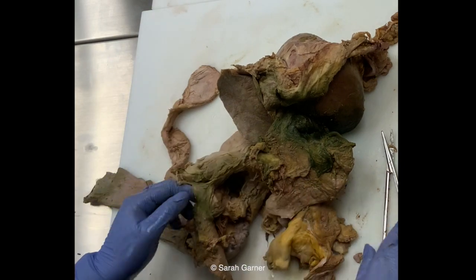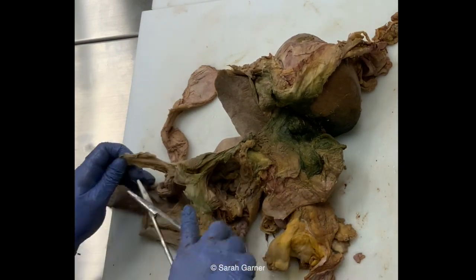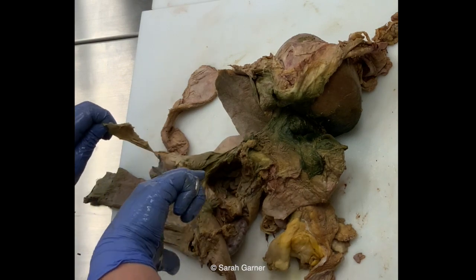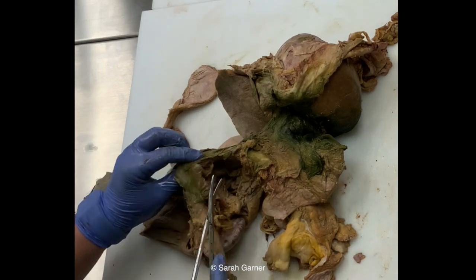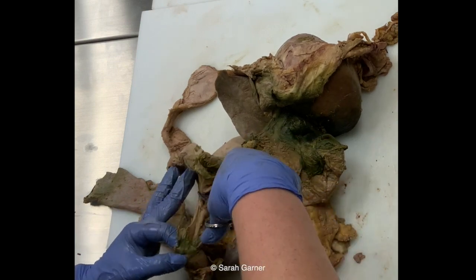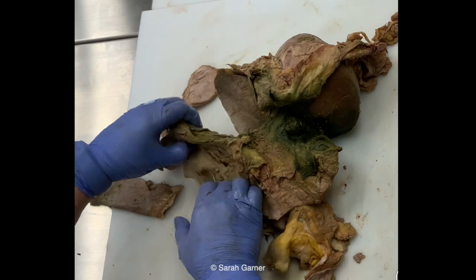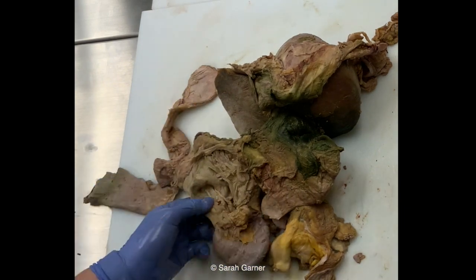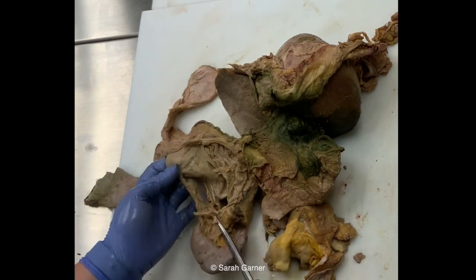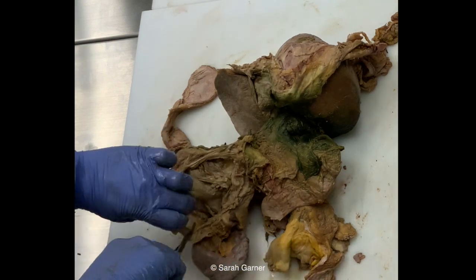But again, you don't want to just go cutting things unless you know what they are. So no random cutting. You don't want to accidentally cut into organs that you need to examine. So here, I know that this is just a fold of peritoneum, so I'm going to go ahead and cut that. If I didn't know what that was, I would not have cut it. So this is clearing our view up a little bit. Here, this is just a flap of peritoneum connecting your stomach and your spleen. So we can cut through that.